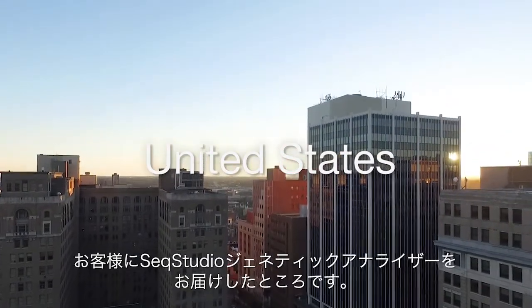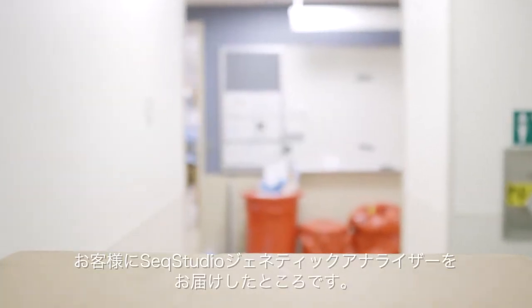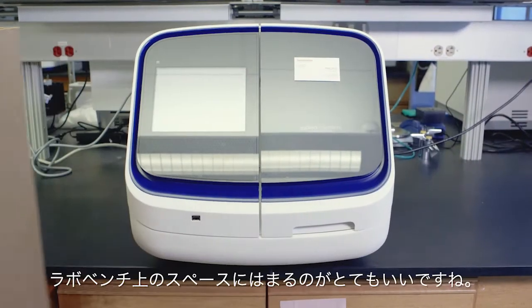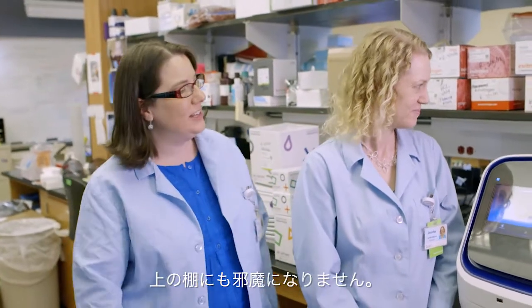Hi there, today we're in Delaware. The customer had just received their SIEC Studio genetic analyzer from Thermo Fisher Scientific. I love that it fits on the lab bench — you don't have to remove the upper shelves or anything.